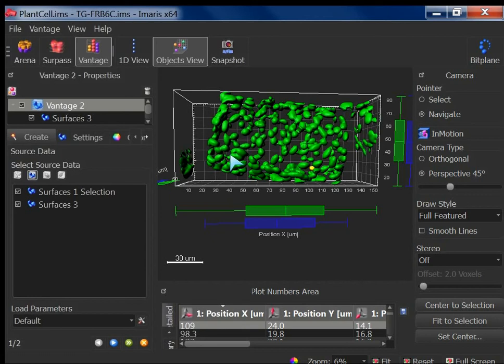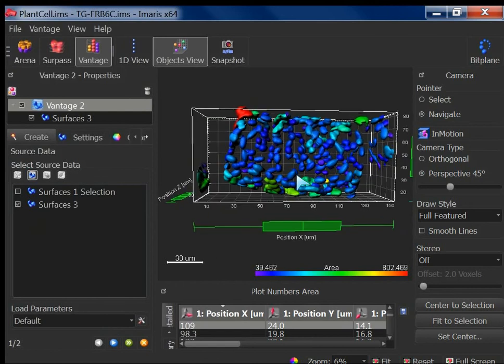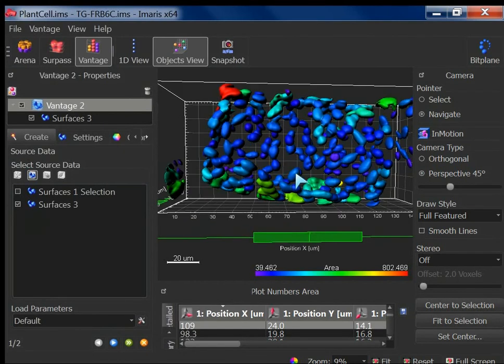So it will project your segmented object in three dimensions. And because in our data set in Surpass we have 2 segmented objects, it will project everything together. But maybe we are not interested in the first one, which was created using absolute, right? Only the local contrast one here. So I would only visualize this data, X and Y. So I would go here, next.